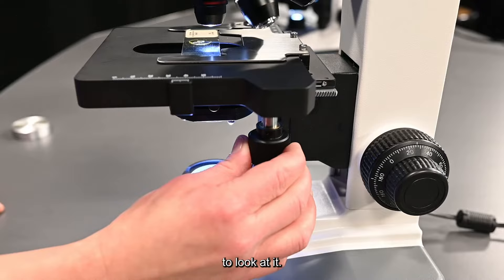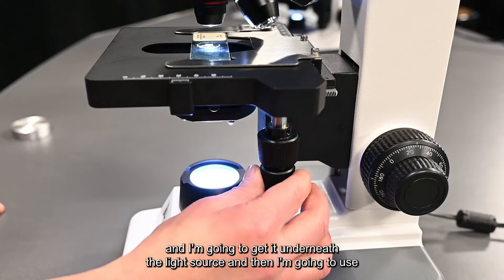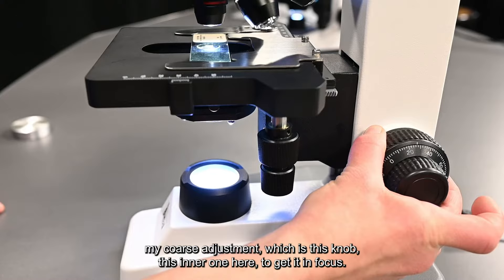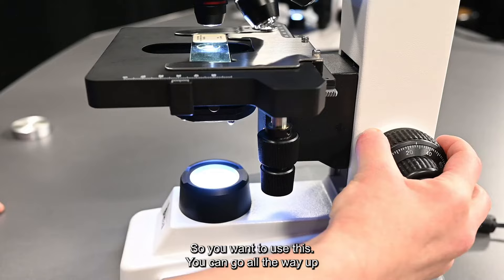Now that my slide is on the stage I need to get it in position to look at it. I'm going to use those knobs that we talked about earlier and I'm going to get it underneath the light source. Then I'm going to use my coarse adjustment which is this knob, this outer one here, to get it in focus.